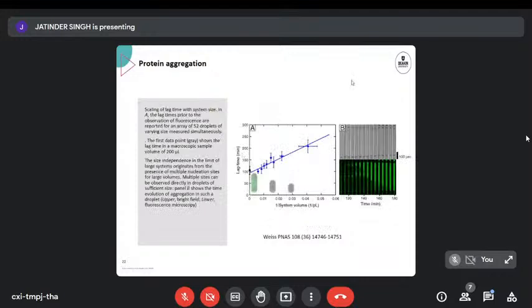This is the quantitative data that I got out. So here we've got the elongated droplets, where we can see that actually the aggregation doesn't start in the middle here, but it starts on the edges. And by the zones getting longer and longer, at a certain point, they elongate to merge and form one zone.